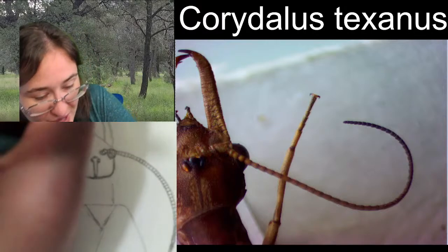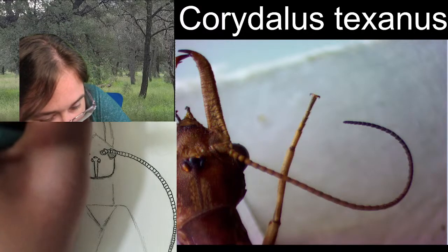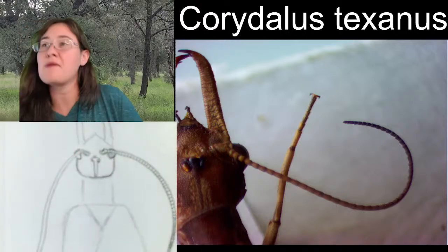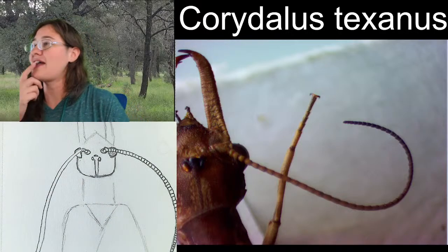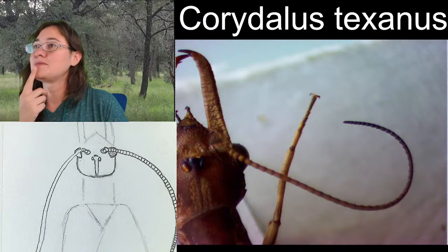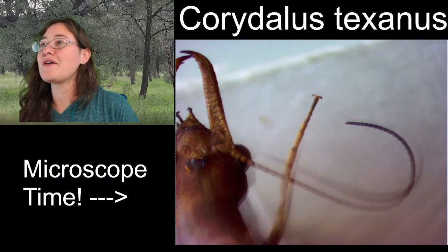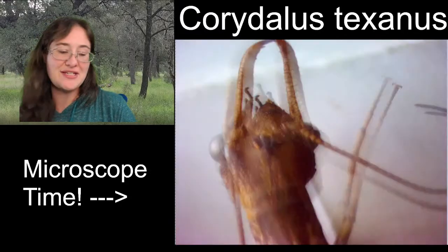That's fine for now. At the end of our sketch, I might come back up and divide these antennae. Alrighty, so we've got those antennae figured out.